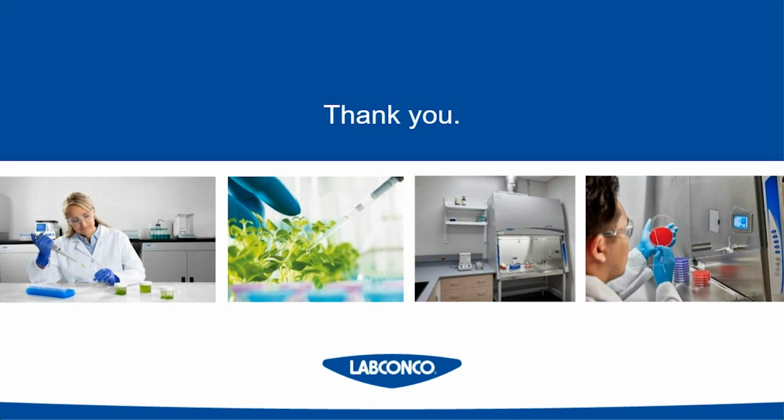All right, wonderful. Our next question here is, I'm not clear on why a C1 is more beneficial in a cell culture room than a B2. Can you explain? That's a really good question, and it depends again. The B2 or C1 would be the cabinets you would look at if you're using chemicals that require exhausting. A lot of times, cell culture rooms or cell culture suites are very small. So you maybe have one or two cabinets in there and a couple of incubators and maybe a counter and a sink.